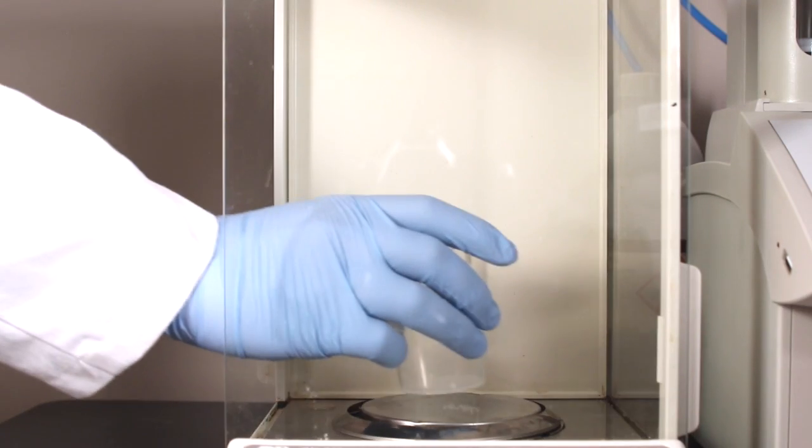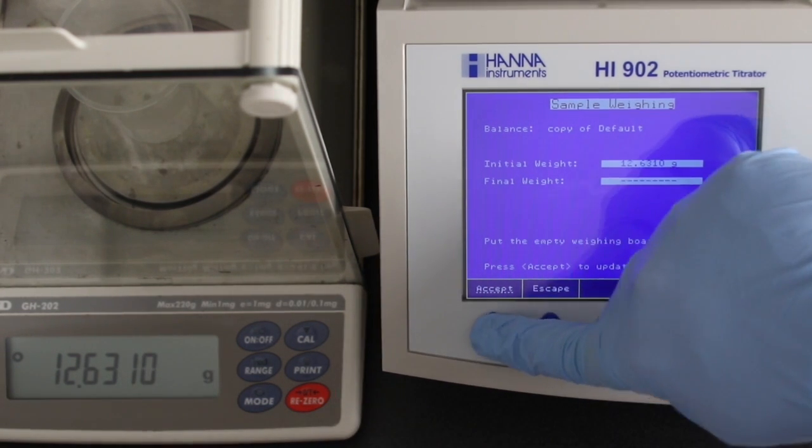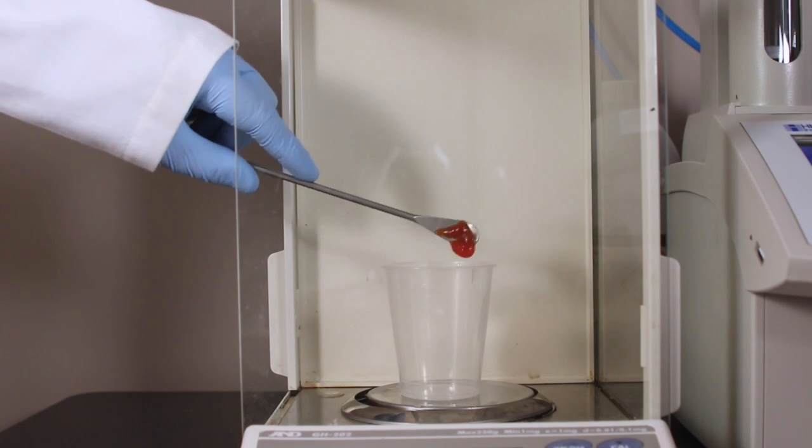We will perform an analysis by weight, although volumetric analysis can also be performed. An analytical balance can be integrated with the titrator via an RS232 connection.